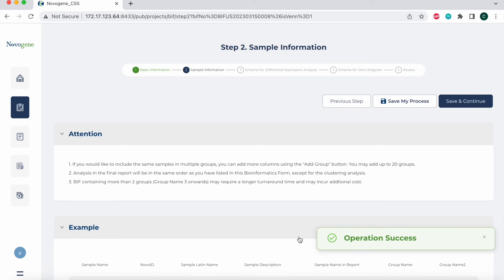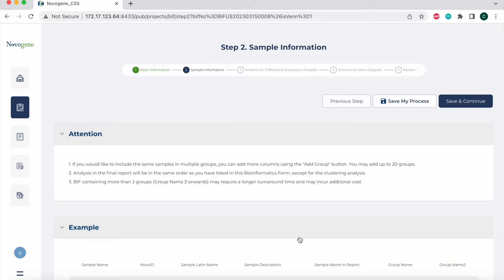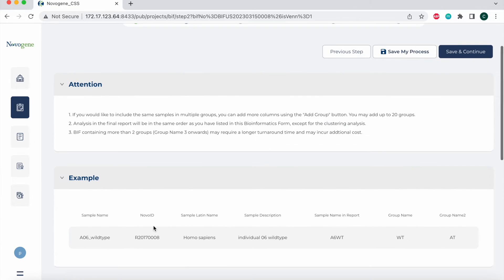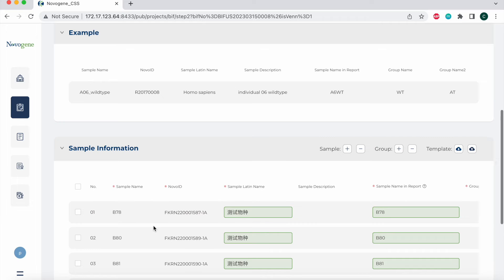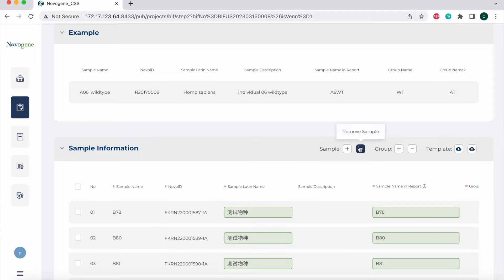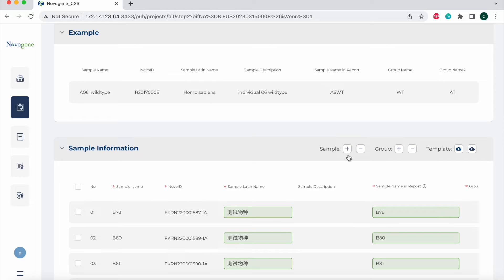The next step is to fill in the sample information. In this step, we provide the attention section and the example section as a guide to help you fill in the sample information successfully. You first need to select the sample list in your project and add or delete samples by clicking the sample plus or minus button on the upper right hand corner. All the available samples under the contract are listed in the pop-up window. You can easily filter the samples by sample name, Nova ID, sample QC results, or sample Latin name.